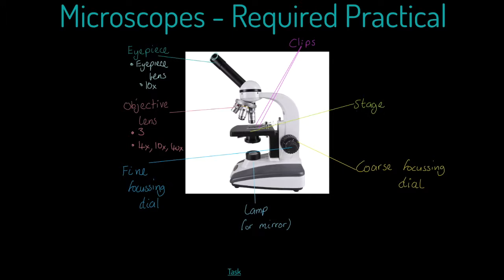A couple of other features. We have the stage here, and this can move up and down if we use our focusing dials. We've also got the clips here. We must use both to secure our specimen.